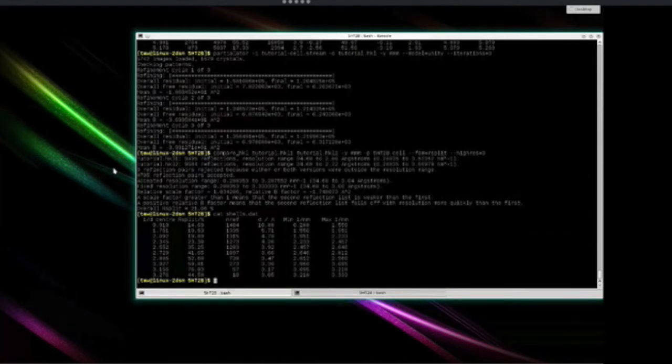Questions? For the data processing, is the bandpass of the free electron laser such that all reflections that you're collecting are partial, right? Yeah, that's at least what is normally assumed. So you assume a monochromatic beam, and then okay.